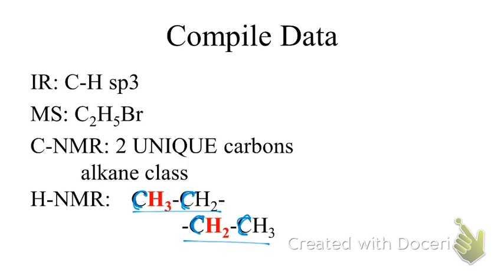Okay? What does your mass spec tell you? You only have 2 carbons. What does that mean happened in your HNMR? You counted your carbons twice. So we need to go back to the pieces that we found from our HNMR and see if there's duplication. Do we have a way that we could condense these 2 pieces together? Yes, which means we can eliminate one of them. How many carbons do I now have according to my HNMR? How many hydrogens? 5. I'm still missing something.